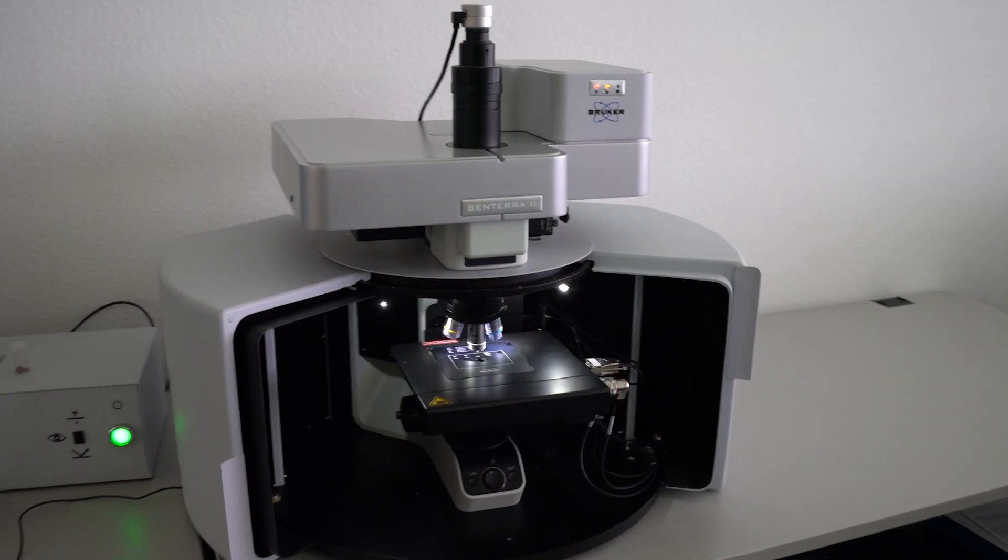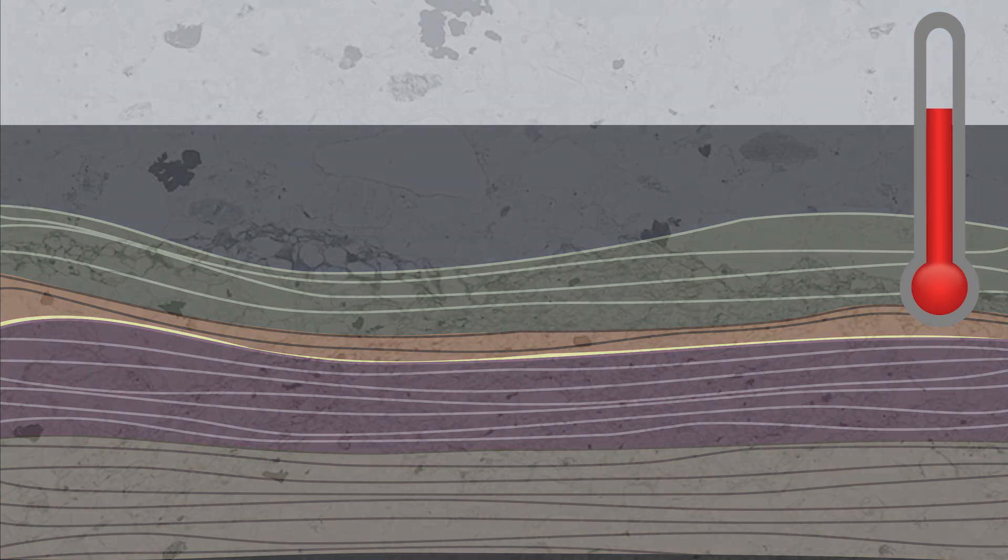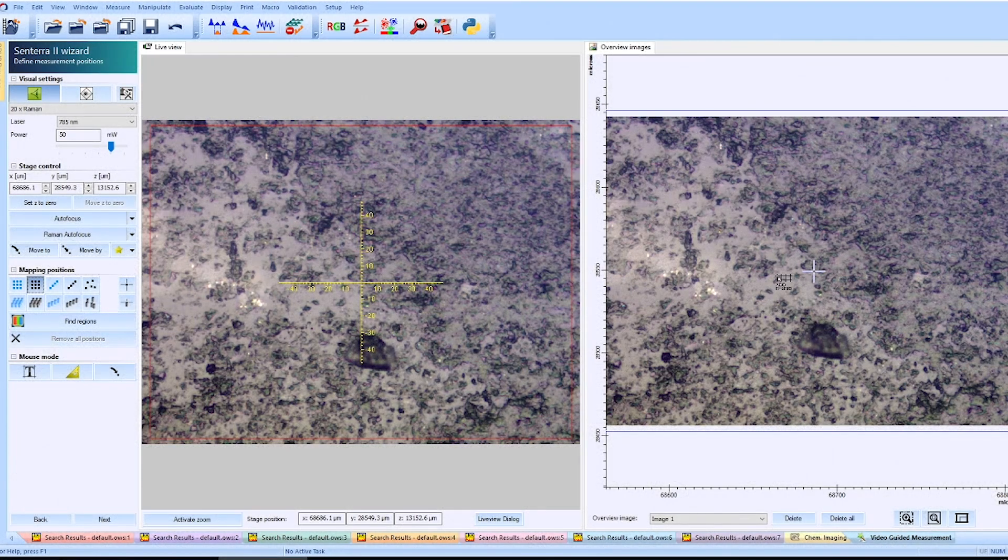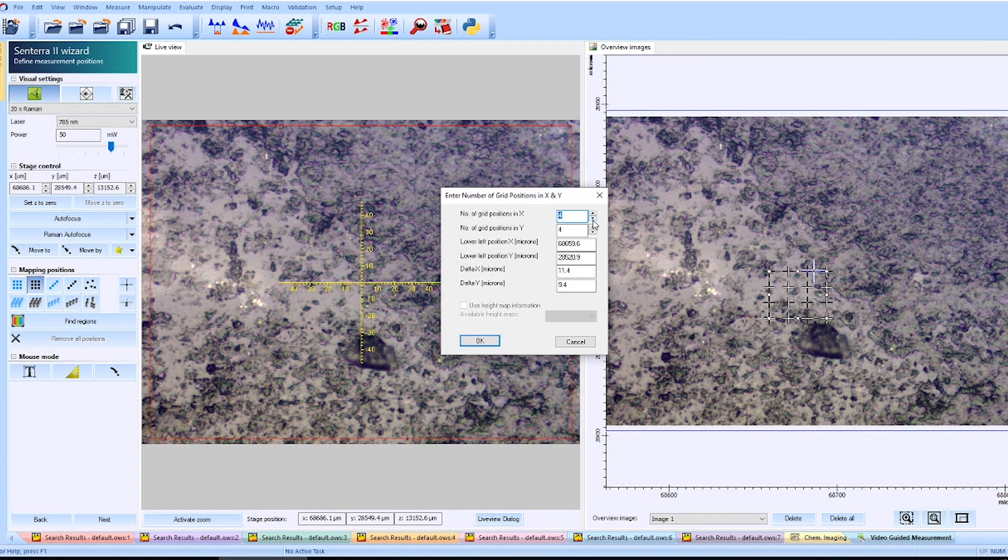Let's have a closer look at how Raman can help in determining the peak temperature that the rock has been subjected to during its long history. For this, we first identify a spot in the sample that is rich in carbonaceous matter.